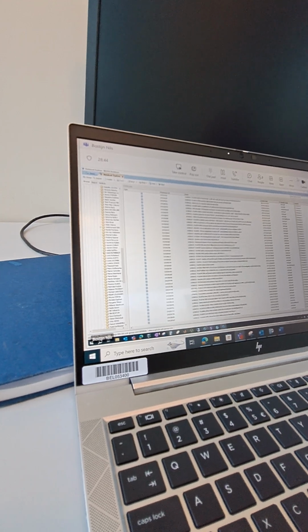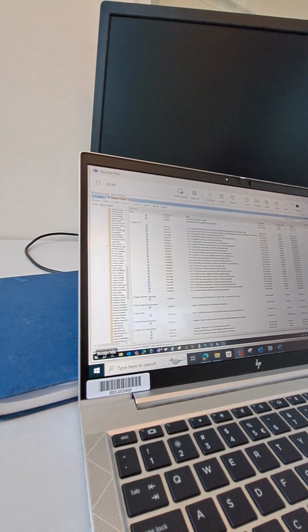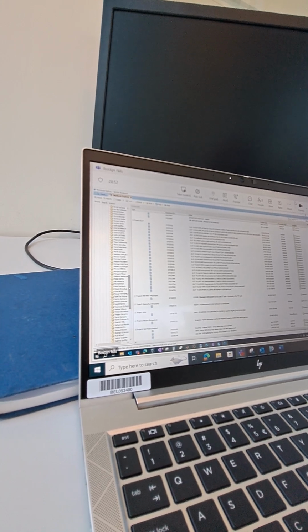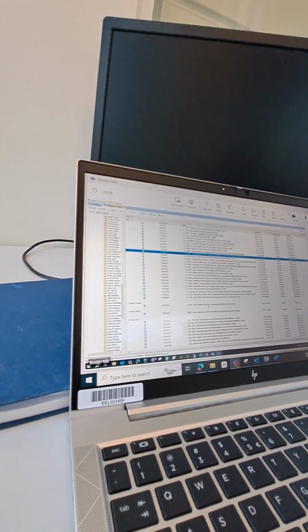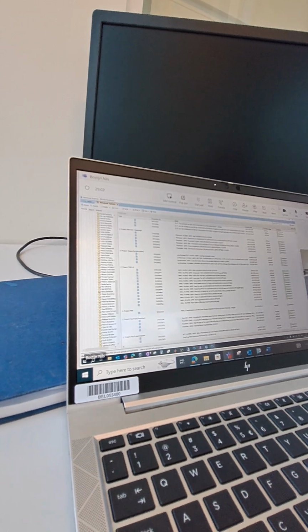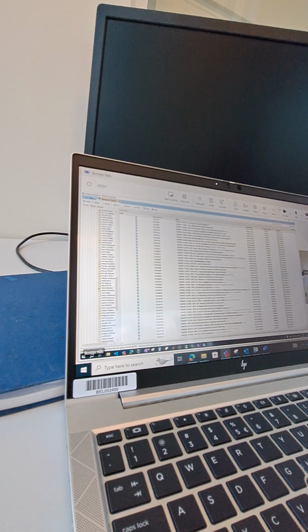Who is the person who is specifically working on salt disproportionation? Nora did some work on it, but she's not any longer in our group. But it will be difficult to search for a specific ELN which is related to salt disproportionation.